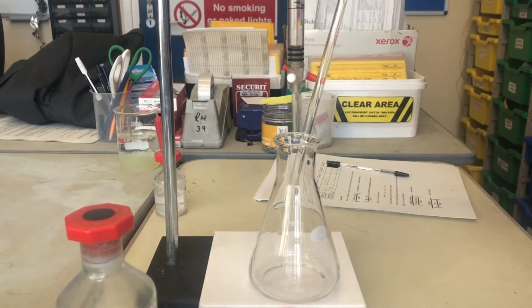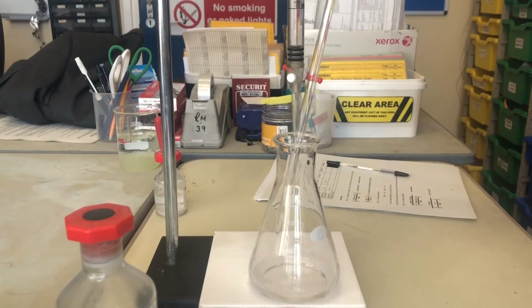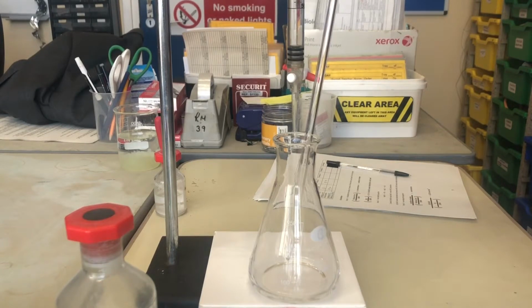I've pipetted out 25 centimetre cubed with this long glass pipette, and I'm now letting that drop into the conical flask here. This sodium hydroxide, we don't know the concentration of it, so we're going to add acid to it until it goes neutral. So the last bits of sodium hydroxide are dropping out of this pipette now.